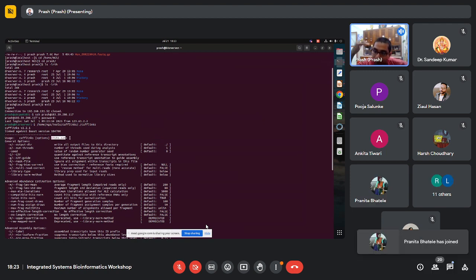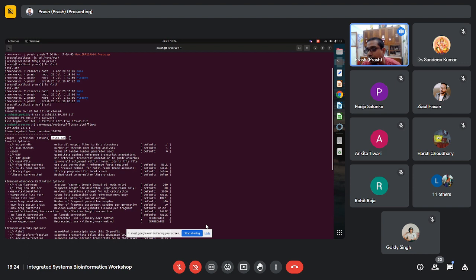So you run the normal FastQC, then you go for HiSat2. HiSat2 is used to check the splice junctions. Those regions wouldn't be missed when you run HiSat as opposed to Bowtie2. And then you come up with cufflinks. You can even use SAMtools sort, where you sort the BAM file, and that BAM or SAM file you can use with this particular command.